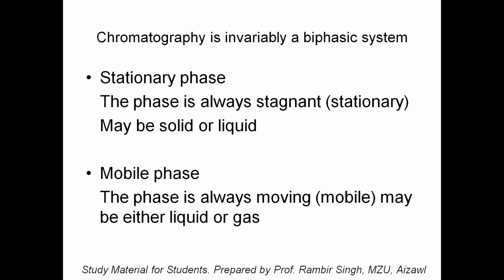So what people did actually, people liquefied gases. So if I liquefy a gas like say carbon dioxide, then what will happen? It will be having mobility like a gas. It will form the liquid, and it will be a liquefied gas. We cannot call it liquid, we will call it liquefied, and that's why we do not call it solvent. We call it fluid. Don't call it solvent.